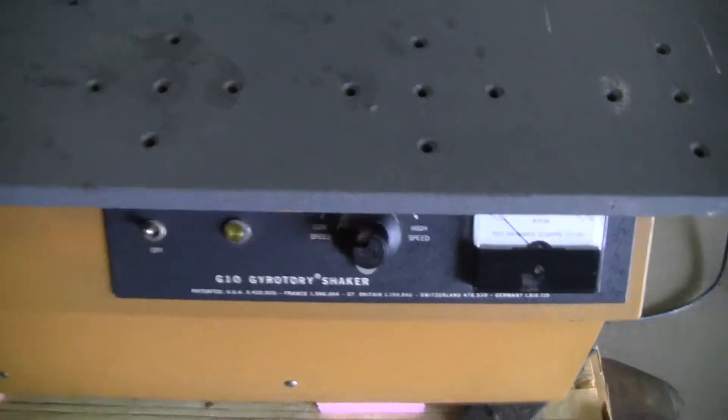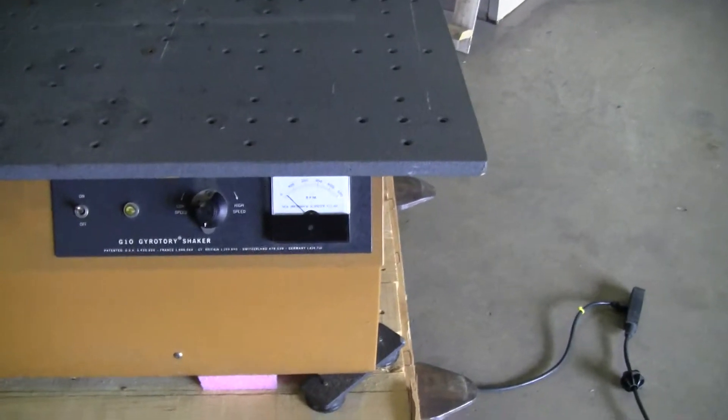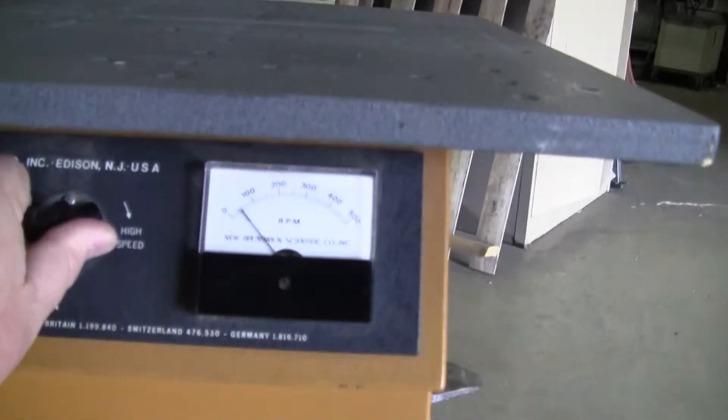It runs on 115 volts. There's your very low, as you can see. Turn it up.